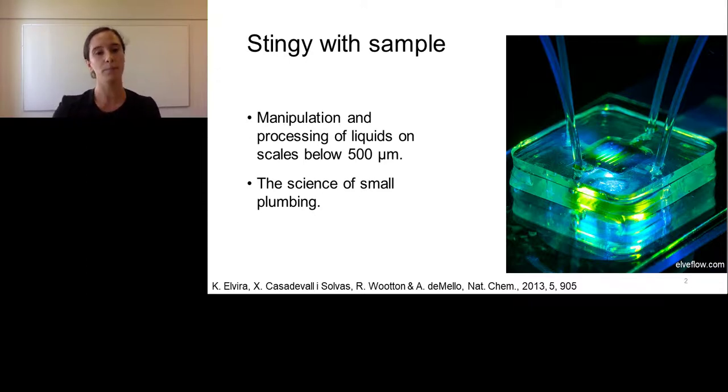Okay, so a more standard definition is there on the slide. It's the manipulation and processing of fluids on scales below 500 micrometers. If you want to compare that to something in real life, scales below 500 micrometers are on the scale of a human hair, okay?